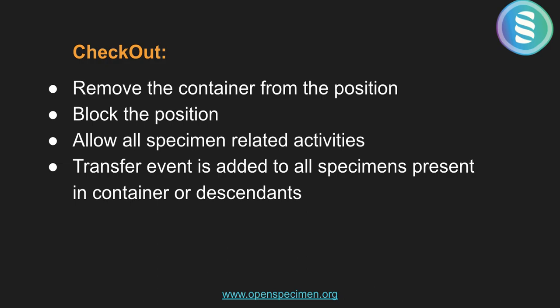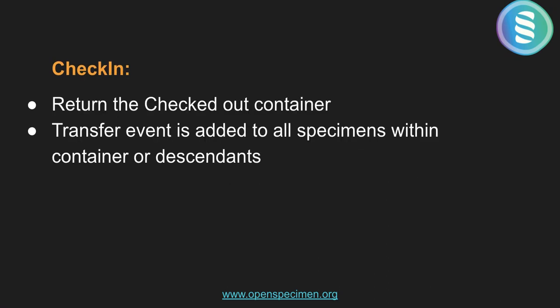So, for example, if you check out the rack, all the specimens that are stored in the boxes that are present under the rack, all of them will have this transfer event. And the check-in, it is nothing but the return of the checked out containers. So another transfer event is added to all specimens within the container or its descendants.